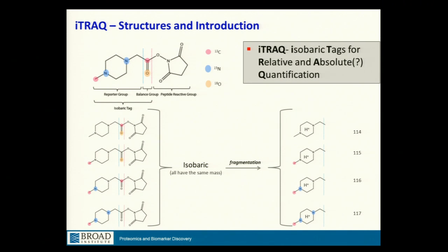which stands for isobaric tags for relative and absolute, and I put a question mark by the absolute because I'm not really sure how it's absolute, but they like to claim it is. Quantification. At the end of the day, it's quantification.